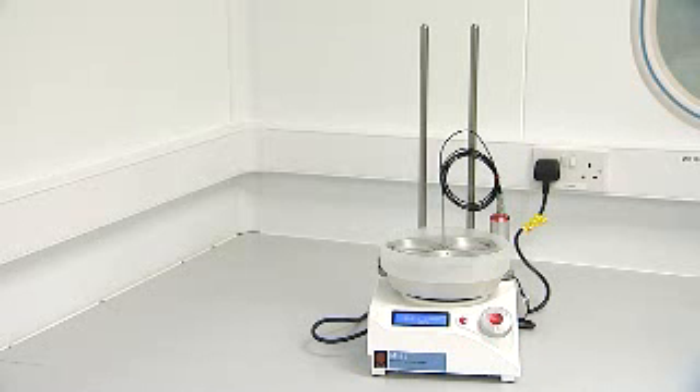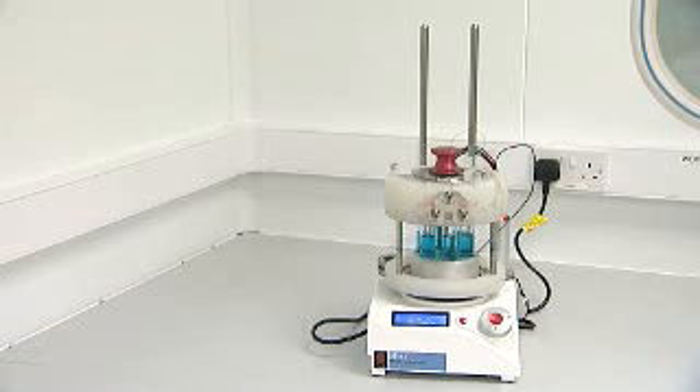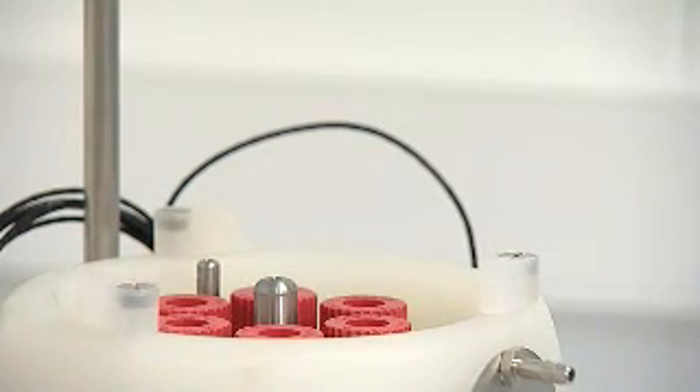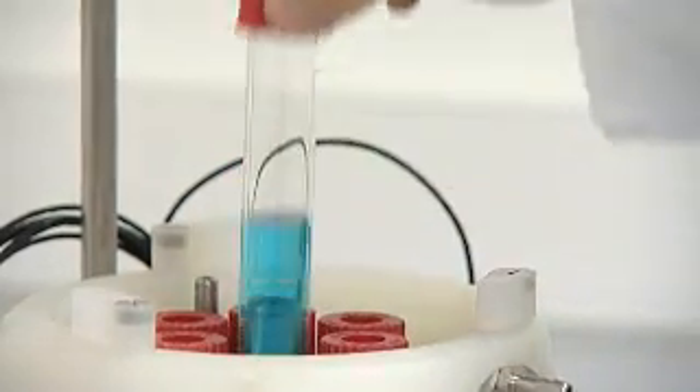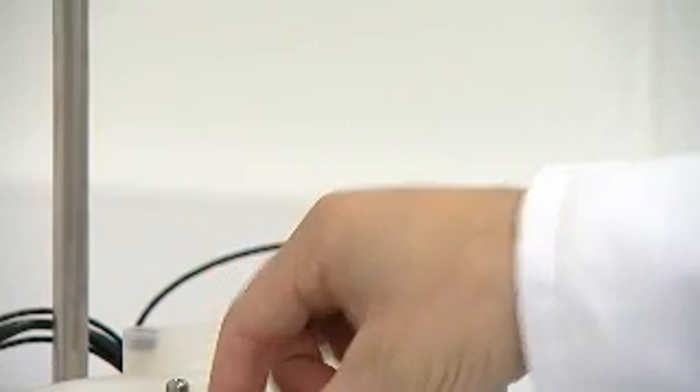For parallel flasks, the stacking dry bath can be substituted for a triple bath. And for parallel vials or reaction tubes, it can be replaced with vial baths or orbit systems if reflux or inert conditions are required. Available for six 45 ml tubes or twelve 10 ml tubes, the orbit systems offer efficient parallel chemistry with easy access to reaction tubes.